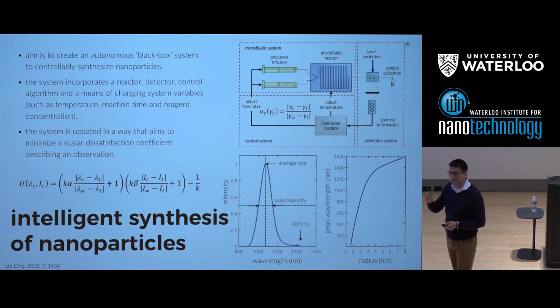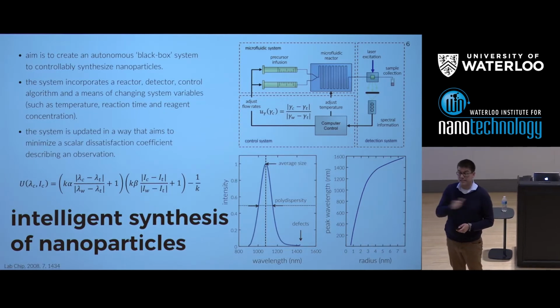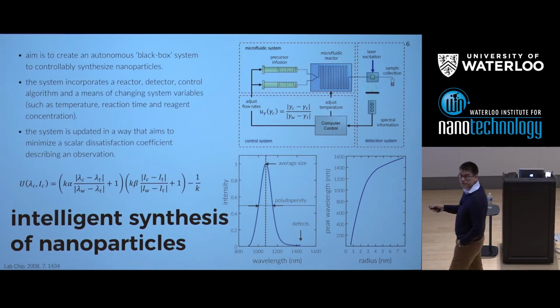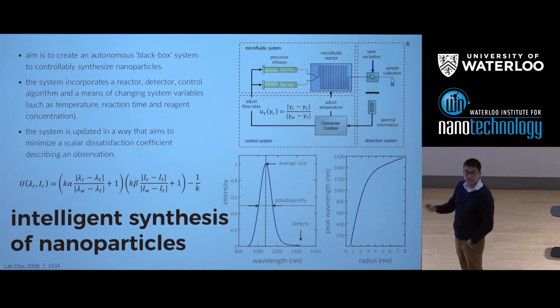So this is the big advantage of using microfluidics here: our ability to integrate it with an optical detection system that gives us information. If you look down at the bottom here, this is just a standard band-edge emission spectrum of a quantum dot. The important thing is, if I measure this, and I can measure this very quickly on a millisecond timescale, the peak here tells me immediately about the average size of the particles that we're looking at.